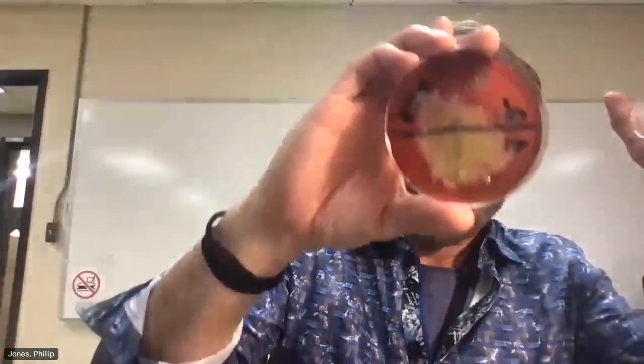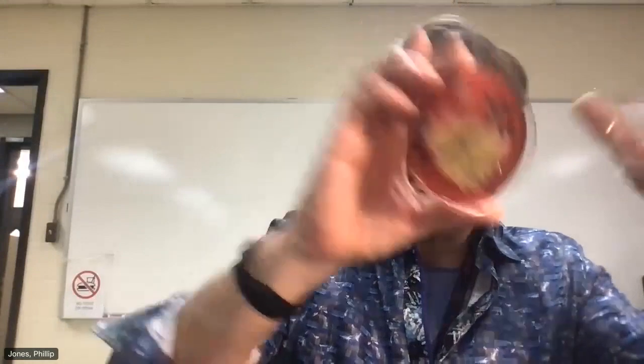I'm going to do some really good Gram stains on these. Somebody had some really great colonies, and I will share those results with all of you in a week or two when I get them done. Around the camera, I should be able to take images of that and upload them for you all. All right, till next time.